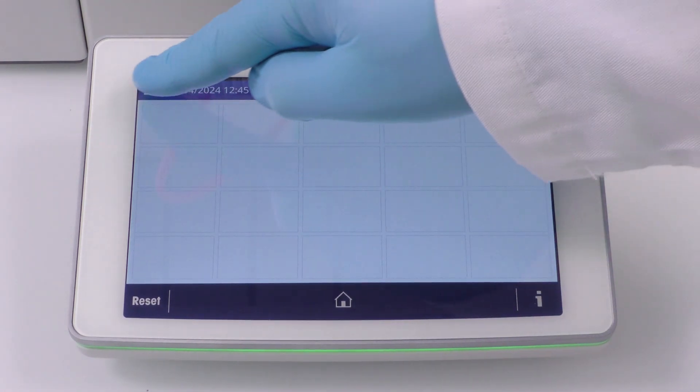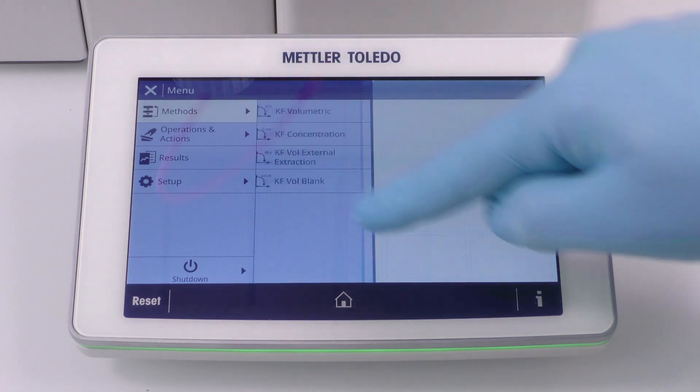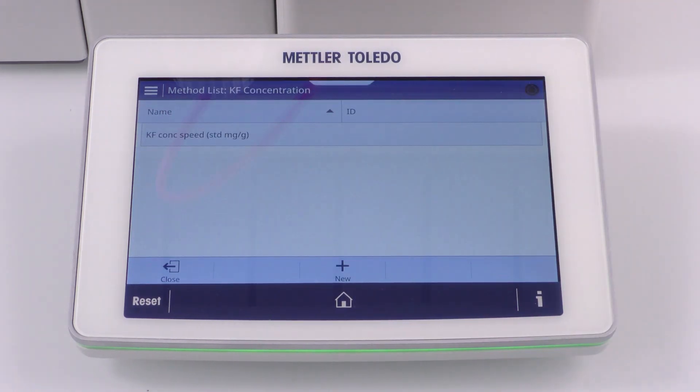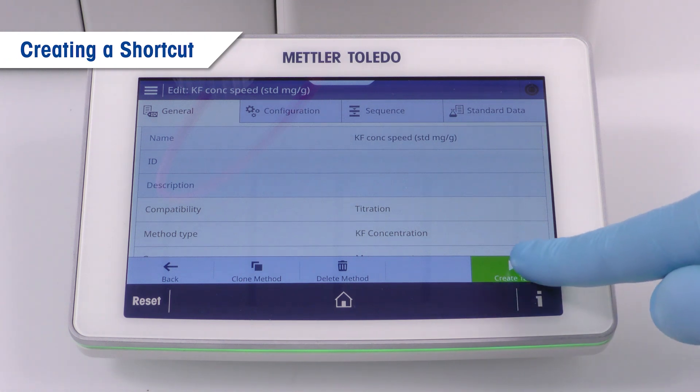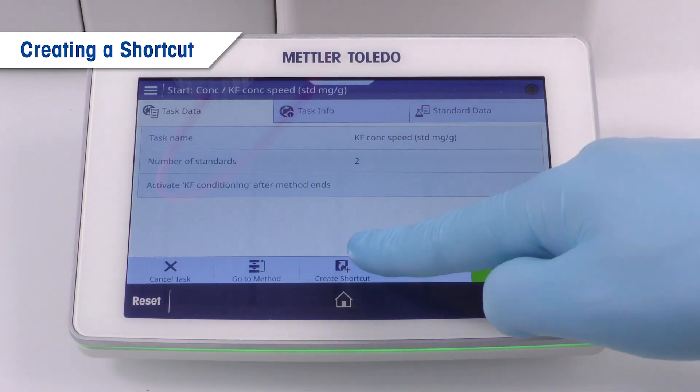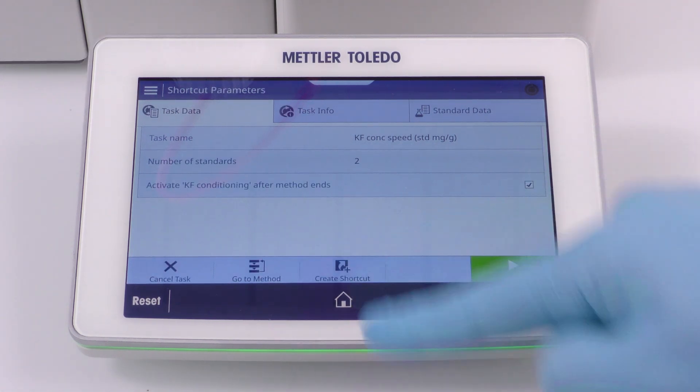It's good practice to adjust the concentration of the titrant daily. Thus, we want to give the operator direct access to this important method via a shortcut. In the method under create task, there is an option to create a shortcut for the home screen.